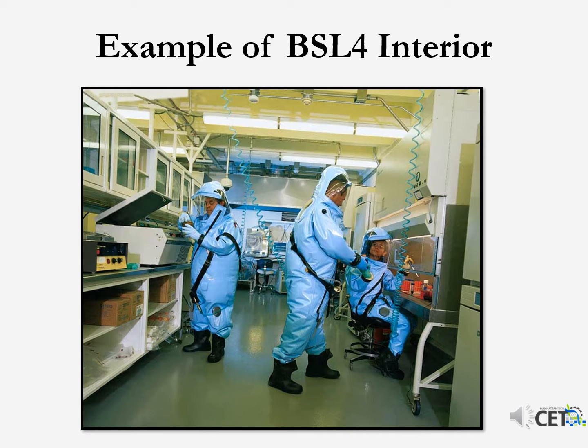So it takes a lot of time to come into and out of these rooms. All the waste that's generated in these rooms has to be decontaminated. So again, the autoclaves in these rooms have to be passed through. They put all the waste in on one side, it's autoclaved, sterilized, and removed on the other side, safe.